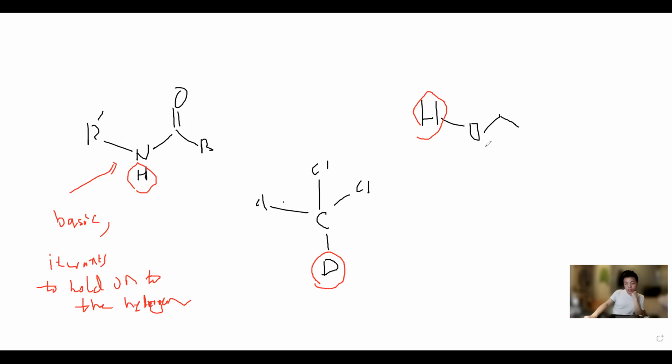And the hydrogen on the ethanol, it's kind of a known fact that this is dissociable. So if this one is being replaced with the deuterium, OD, we get D here, and that's not a peak because it only detects hydrogens instead of its isotopes.